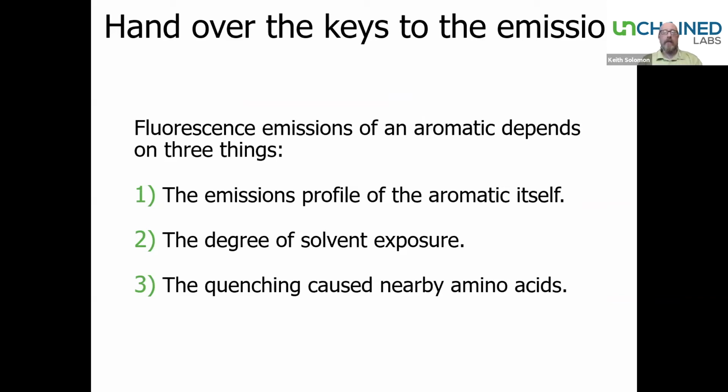So solvent exposure has a stabilizing effect on that pi star electron, and consequently, when it falls back to its normal state, it gives off lower energy or higher wavelength emissions than it would if it was buried in the hydrophobic core of the protein, where most of the time these aromatic residues live.